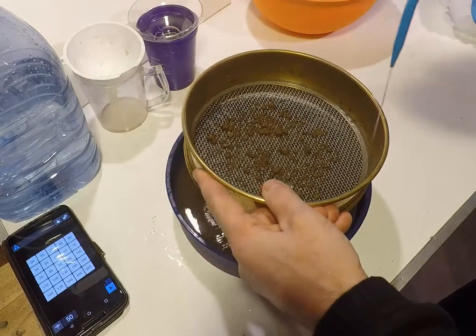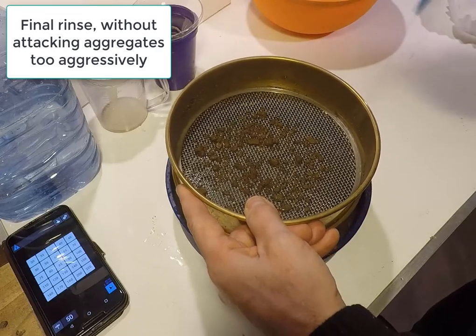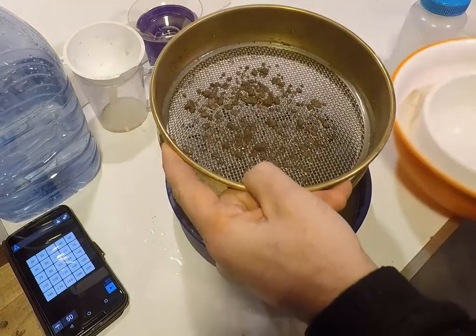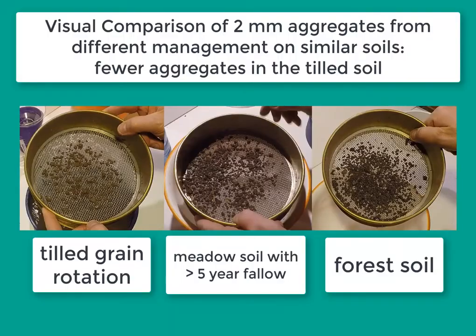Then the sieve is rinsed gently with a wash bottle — this should not be too aggressive so that we are not breaking down any more aggregates than were broken in the washing. The washed 2 mm fraction can then be set aside to be captured and dried later. Note that already at this stage there may be noticeable differences between different soils in aggregation, shown by differences in the amount of 2 mm water stable aggregates.